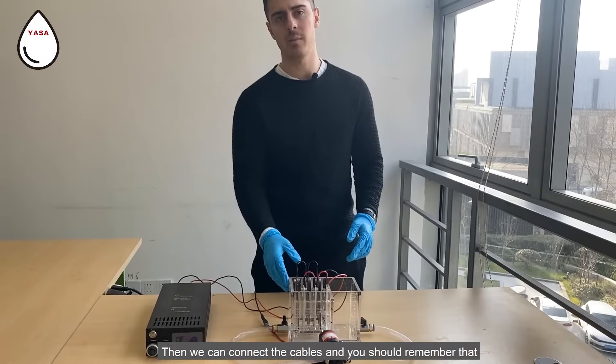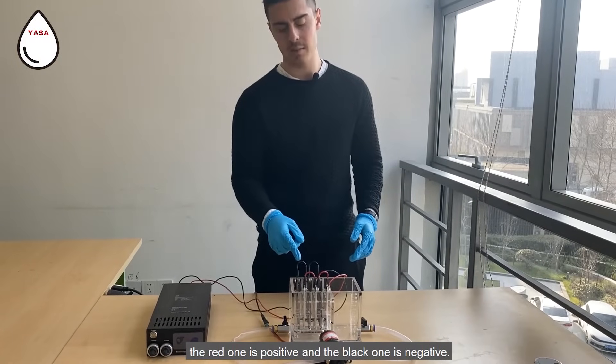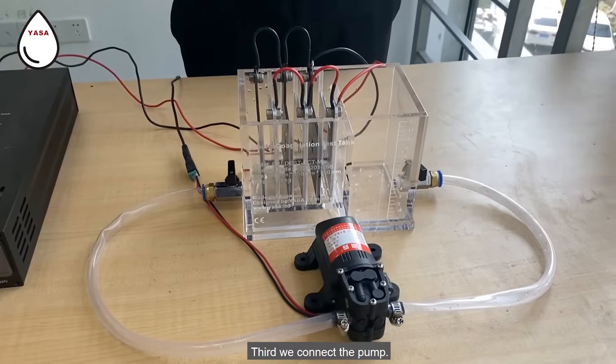Then we connect the cables — remember that the red one is positive and the black one is negative. Third, we connect the pump.